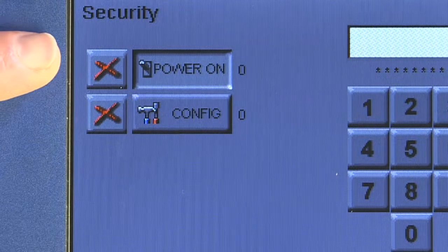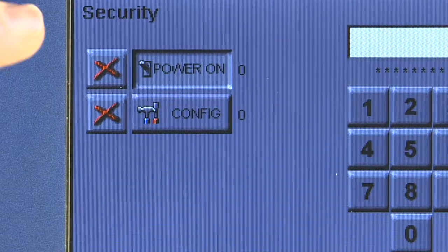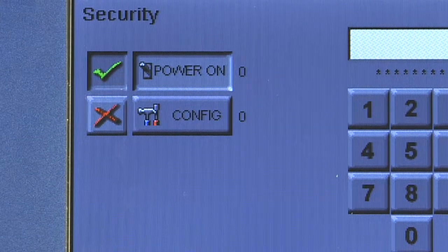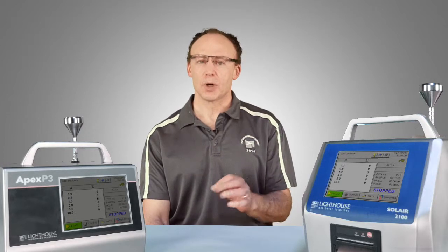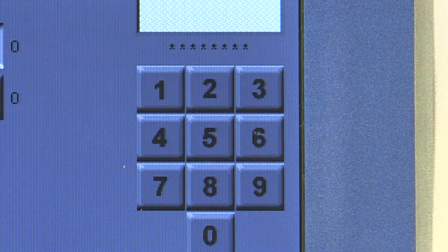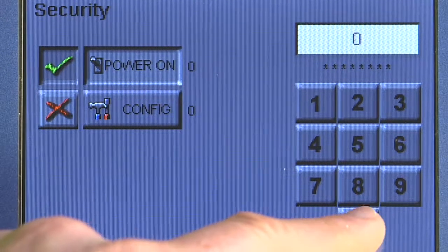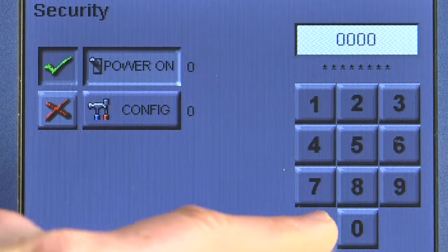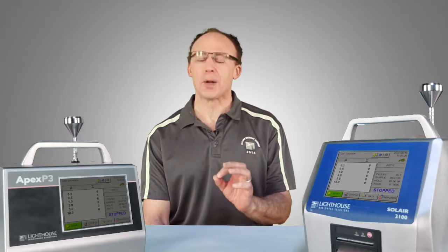You're going to notice we have a couple of options: we have a power on password and a configuration password. If I enable the power on password, when I reboot or restart my instrument I have to enter a password before I'm able to use it. Let's set that now — we're going to set a password of zero zero zero zero zero and hit Enter. I've now configured my power on password.